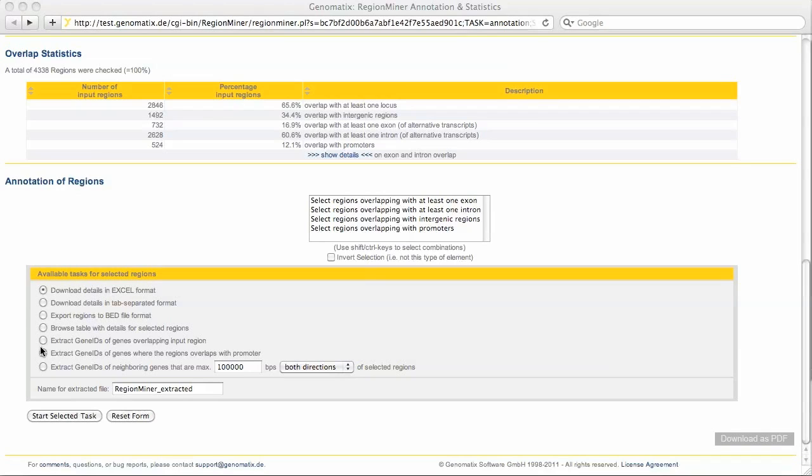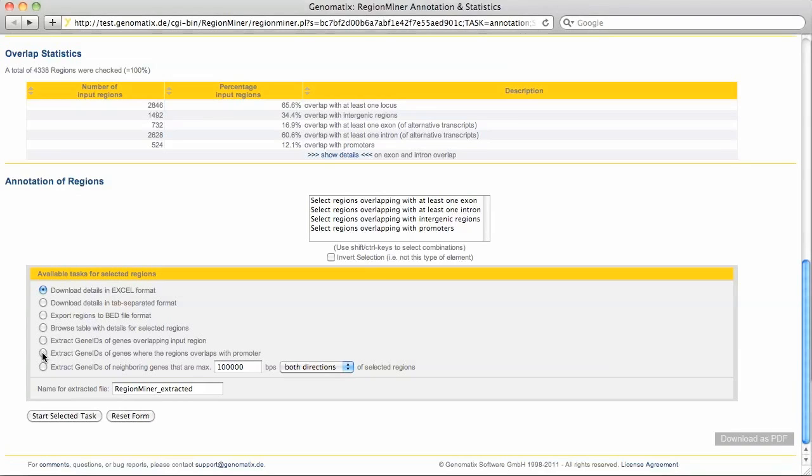You can also download only the gene IDs of genes that have an overlap with an input region in the locus or in the promoter, or which are near a region in a window that you can specify. Here for example I can get the gene IDs of genes with a promoter overlap.